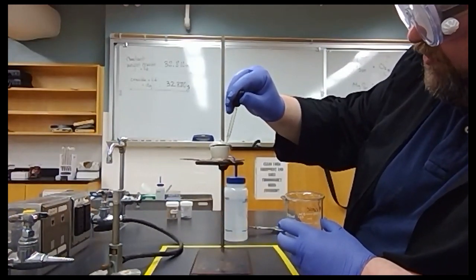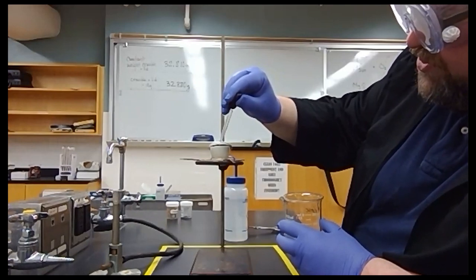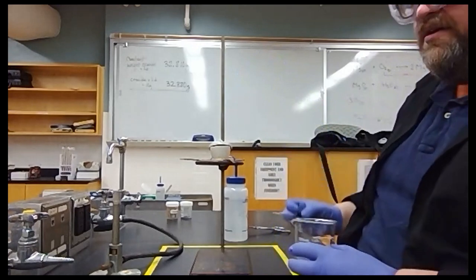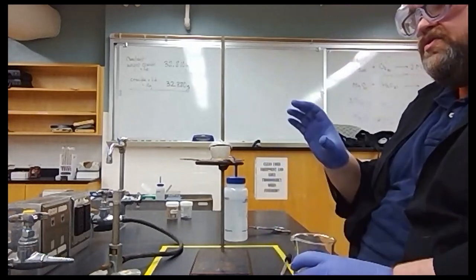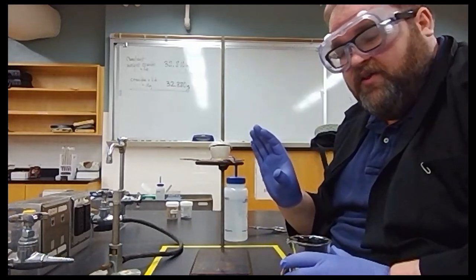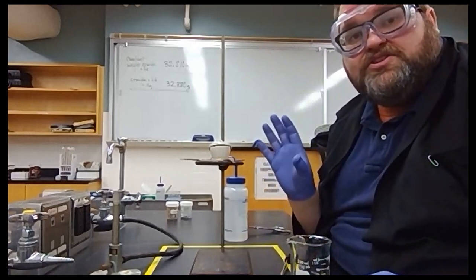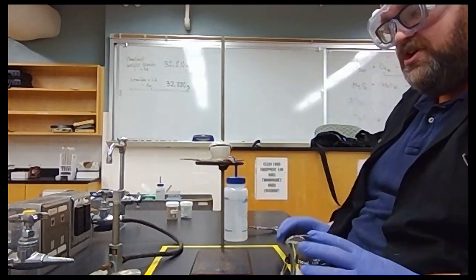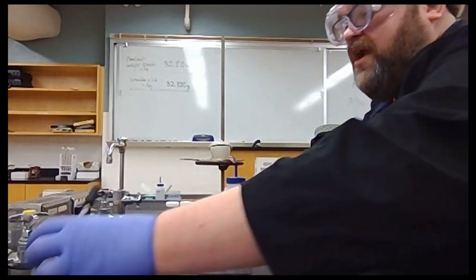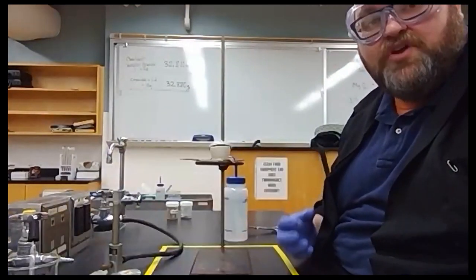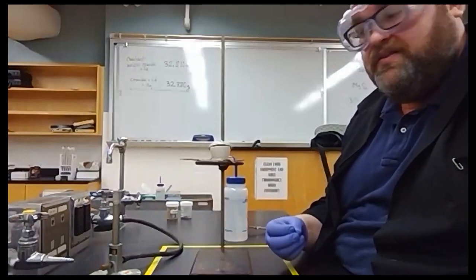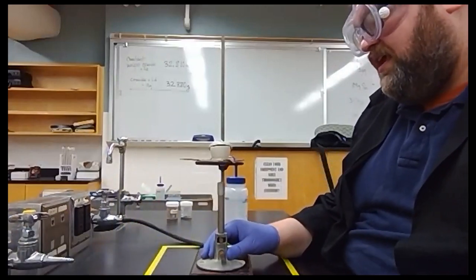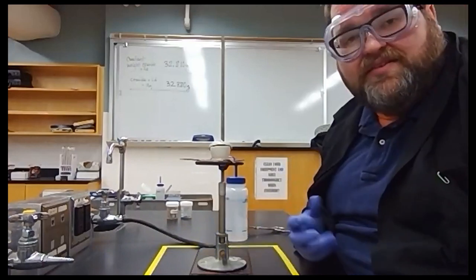Now that's more than enough water, so my magnesium nitride is now quickly converting to magnesium hydroxide. Give that a second, let that conversion happen. And then now we're ready to convert that magnesium hydroxide to magnesium oxide. We do that by adding the heat once again. This time we're just going to have to time it. There's no visual indicator that the reaction is over.